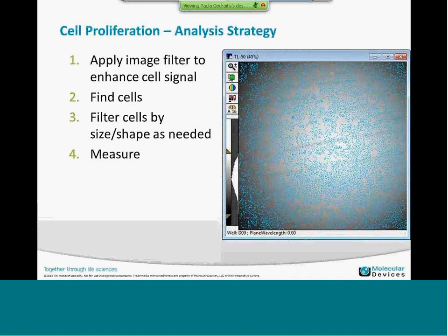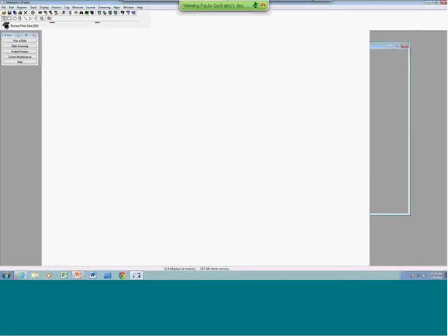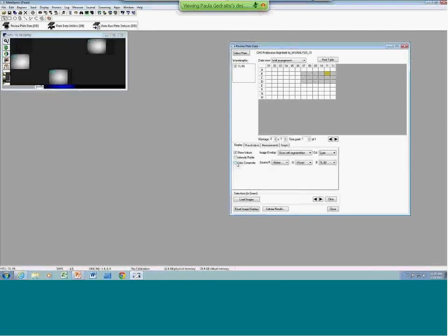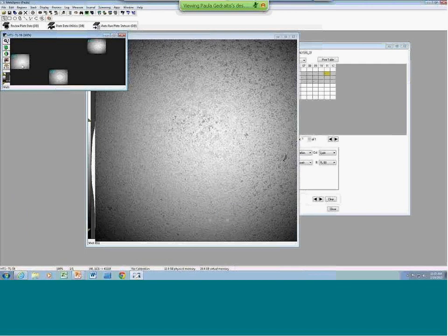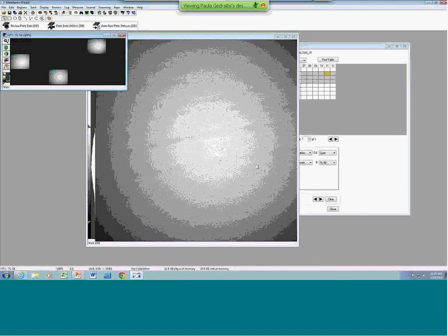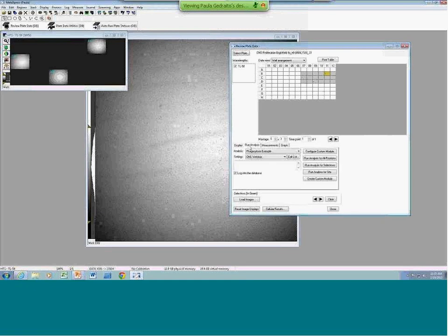Okay, go ahead and go back to the software. And now select my cell proliferation plate. So again, read at 4x. See the different feeds we have here. That's this one. That's the very sparse one. And the intermediate with the scratches on. In my Run Analysis tab, create a custom module.